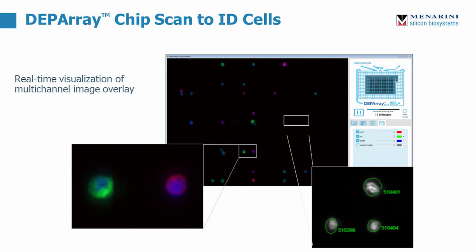To that unique identifier are attached all of the fluorescent and bright field data, so all of this can then be analyzed when you want to isolate the cells which meet certain criteria which you can set.